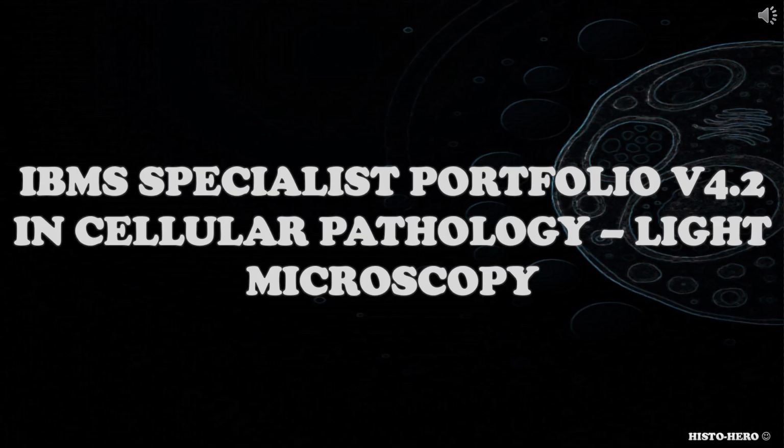And today's video will be about light microscopy, which is part of the IBMS specialist portfolio in cellular pathology.